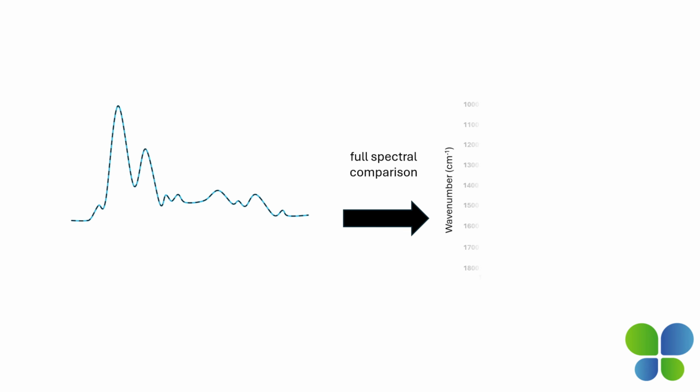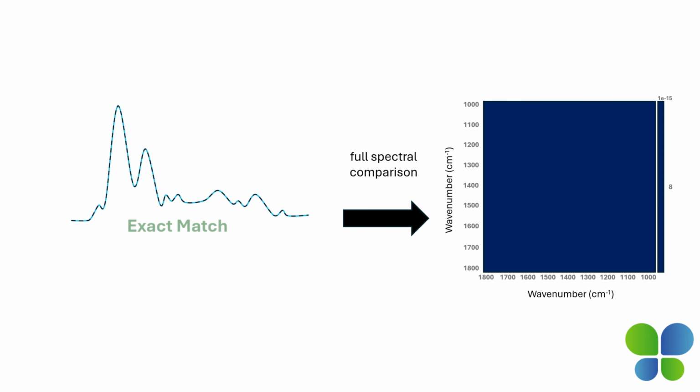When identity is observed, then a highly similar or exact match occurs between the spectra within the full spectral region of 1800 to 1000 wave numbers. A test case like the one presented herein, where the reference is compared with itself, results in an identical match, denoting a Euclidean distance value of 0. Additionally, the 2T2D asynchronous plot does not have any contributing cross-peaks.